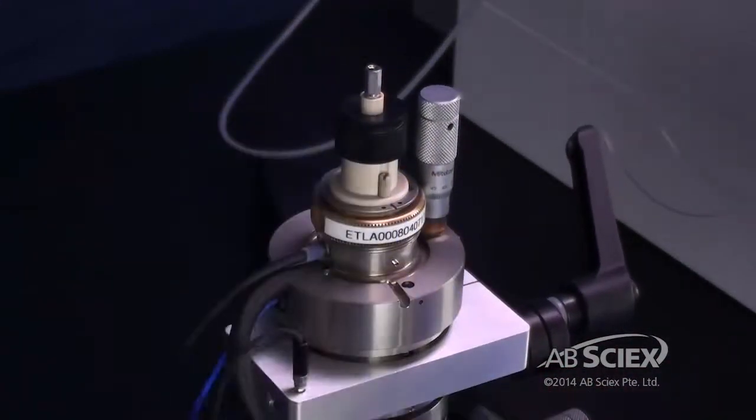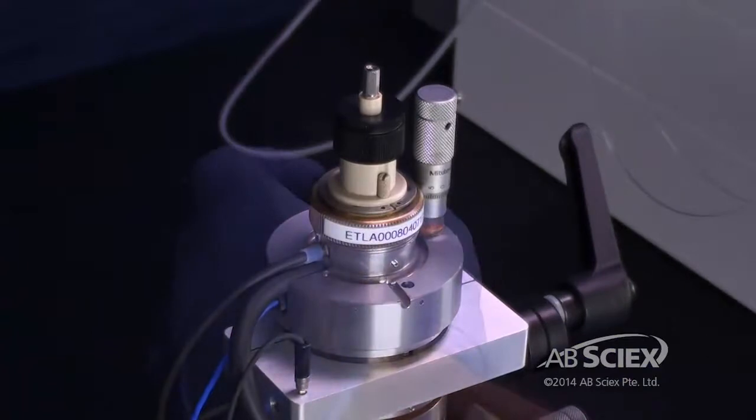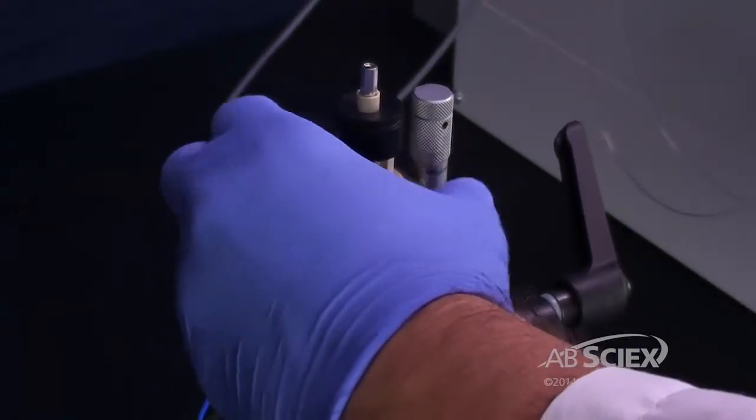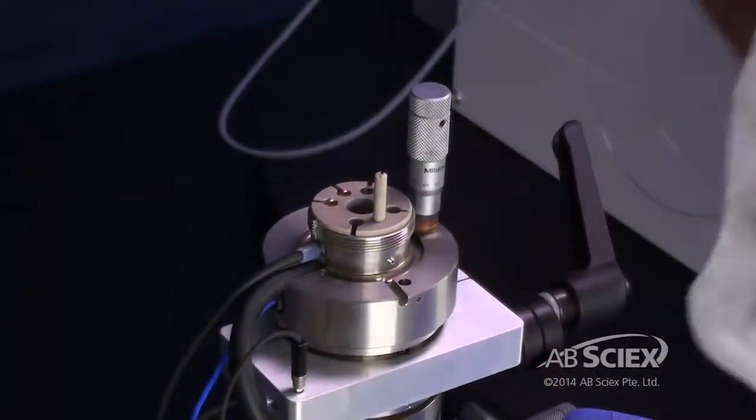Remove the grounding clip from the probe. Loosen the bronze retaining ring that fastens the probe to the iron source housing and gently pull the probe straight up out of the tower.